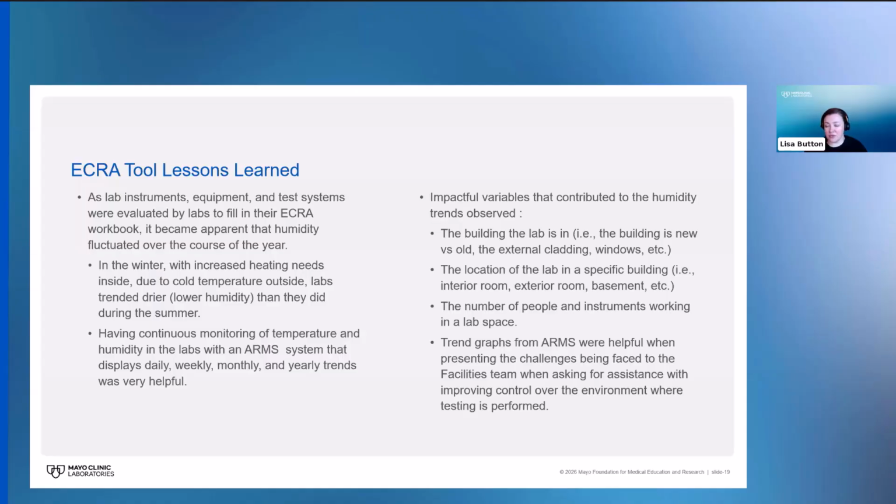And then trend graphs from our automated remote monitoring system were helpful when presenting these challenges that the labs faced to the facilities team when asking for assistance with improving control over the environment where testing was being performed.